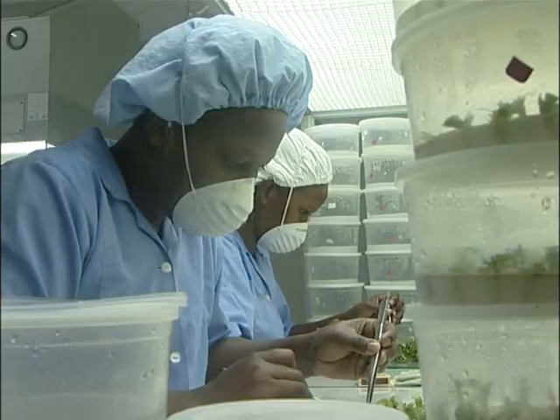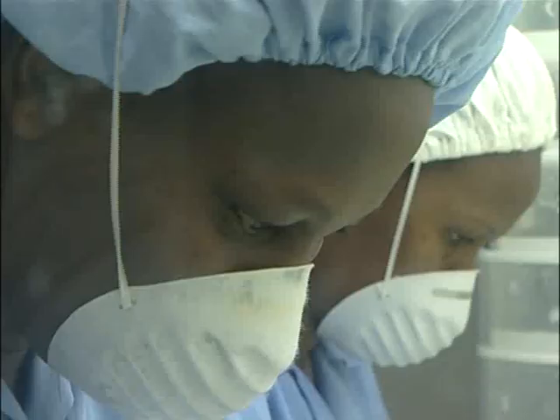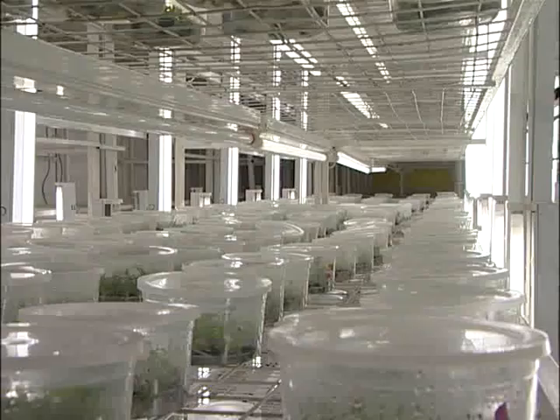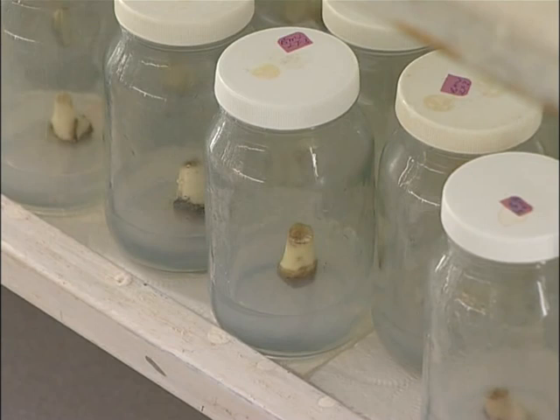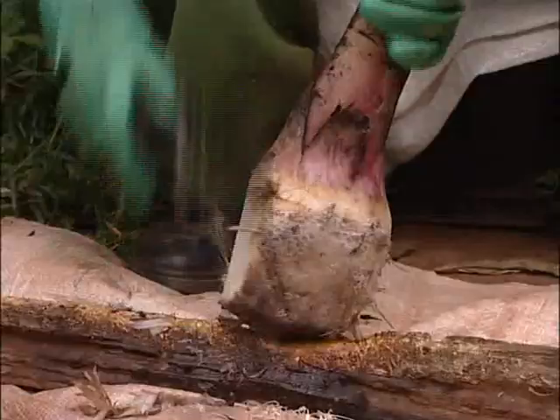The tissue culture technology is a form of biotechnology involving multiplication of cells in a laboratory under sterile conditions. It's more or less like photocopying a document — when you photocopy a document, you get something very close and similar; in fact, you don't change anything.